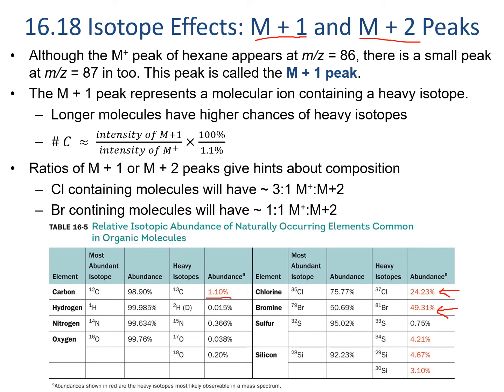You can get some information from the mass plus 2 peak for sulfur. You'd have like a 1 to 25 ratio, so it's not as helpful as it might be if we had a more abundant isotope, but that can still be pretty useful. And for silicon, we can also get pretty decent peaks. Notice now we'd have one major peak that would be about 92.23 divided by about 4%, maybe about 30 times as high as this one, and maybe about 18 times as high as this one.